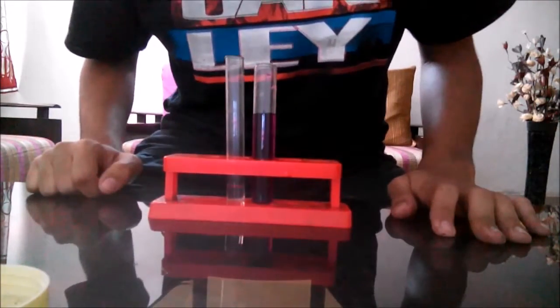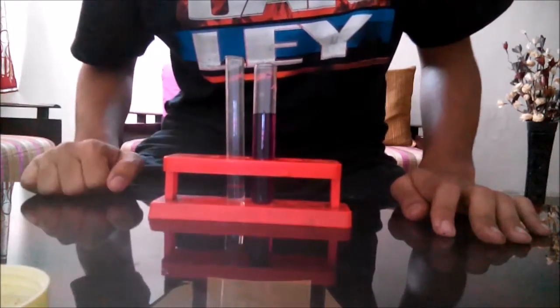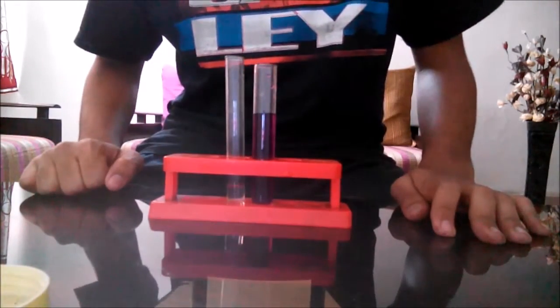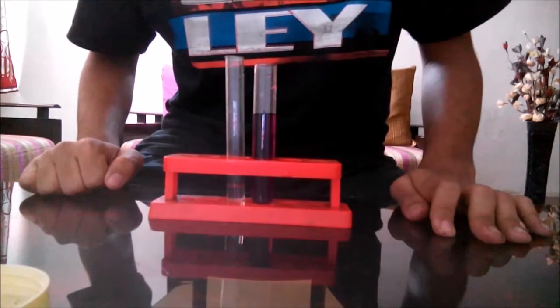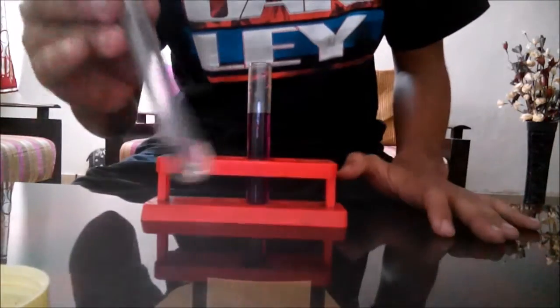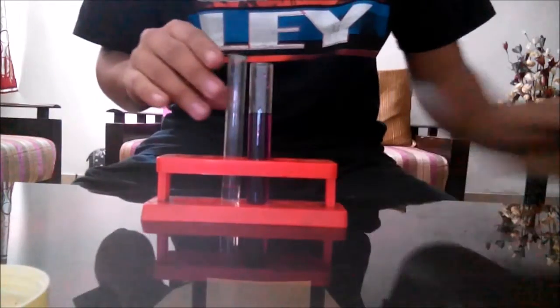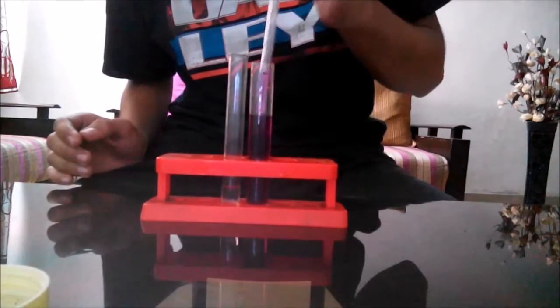In this video I'm going to show you the oxidizing reactions of potassium permanganate on four different chemicals: first is ethanol, second is glucose solution, third is hydrogen peroxide, and fourth is hydrochloric acid. Here I have some ethanol in this test tube and I'll add some potassium permanganate.